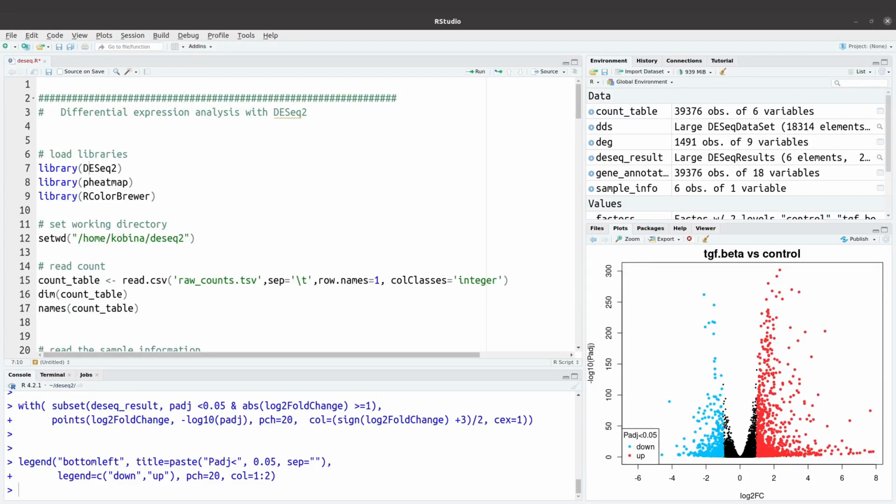Hi everyone, welcome to another episode of my tutorials on RNA Seq data analysis. This is the second episode in the series where I show how to run DESeq2 on your PC to analyze RNA Seq data and identify differential expressions.